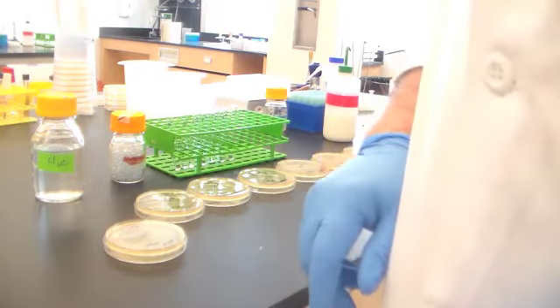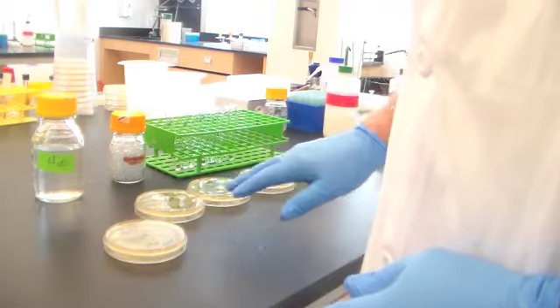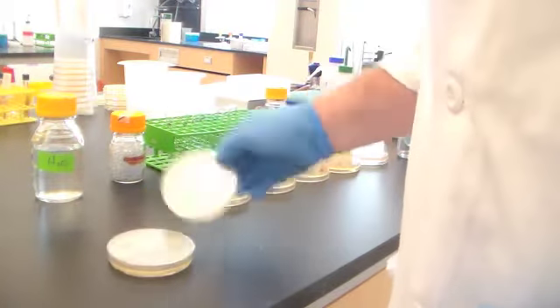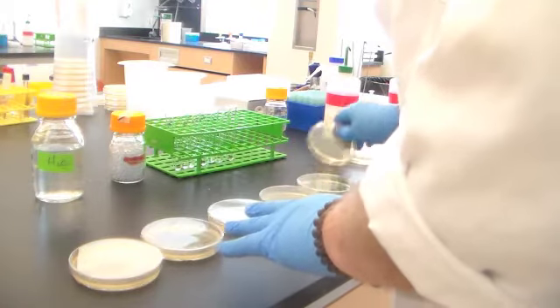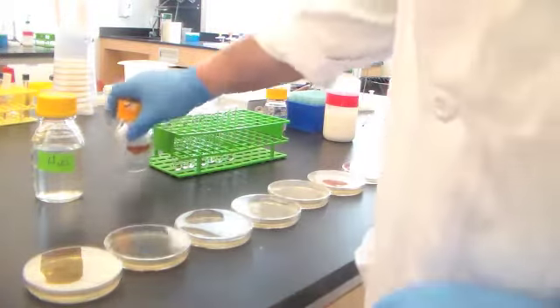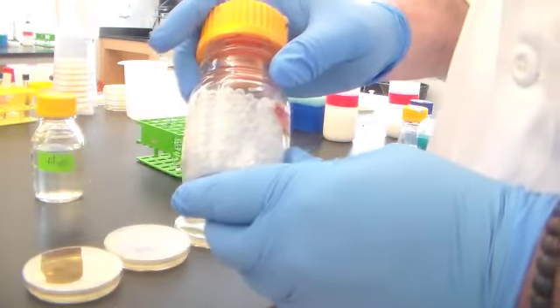Now, what we're going to do is add some of these various dilutions to these various plates and distribute them. In our lab, the way we distribute those plates is actually kind of fun and almost musical. You're going to turn all of your plates, once they're labeled, upside down, and you're going to take these world's smallest marbles.